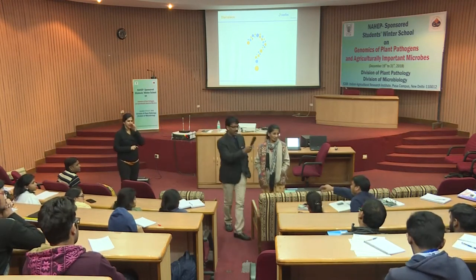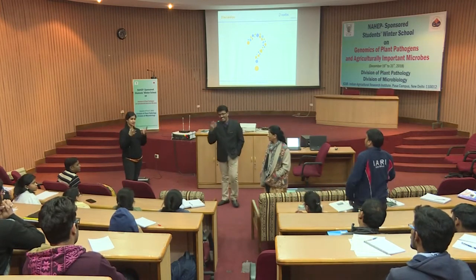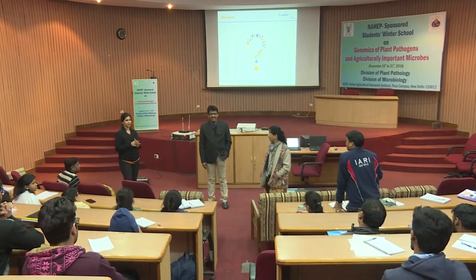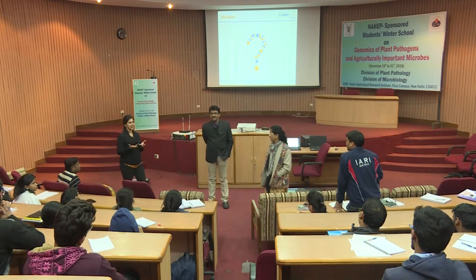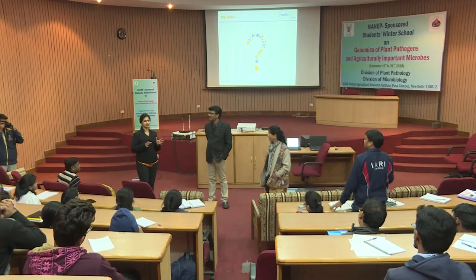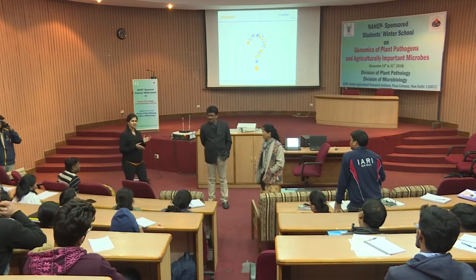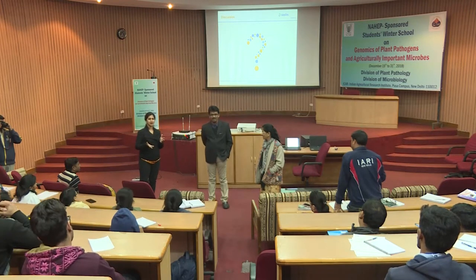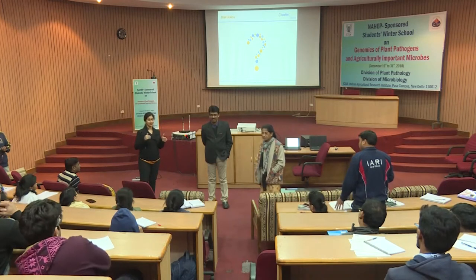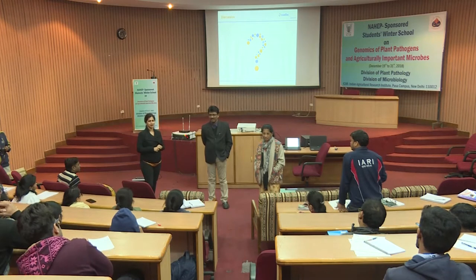There is a question from me. You have the NCBI database where n number of data is there, the raw data people submit. You can go and download and play around, especially for bacteria, because they are smaller data, and assemble them. Every tool, whichever is available, has its own tutorial and manuals, which you can read and do it. There are also GUIs which are freely available. Some have trial periods, like CLC has a 14 days trial period. You can try out those things and play around with it.